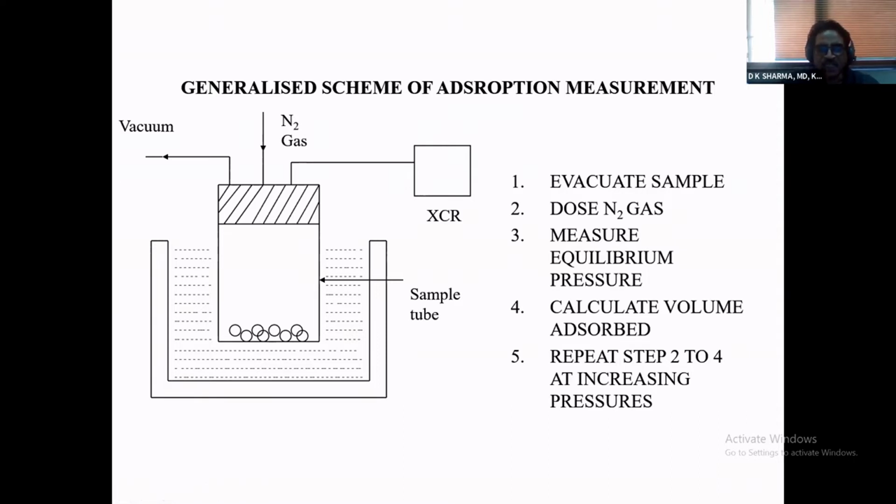Remember when I was mentioning the quantity adsorbed as a function of whatever: adsorption quantities increase when you lower the temperature and decrease when you raise the temperature, under any given conditions. So in order to make a measurable adsorption measurement, we have to cool the sample so that the amount adsorbed increases and we are in a position to measure it.